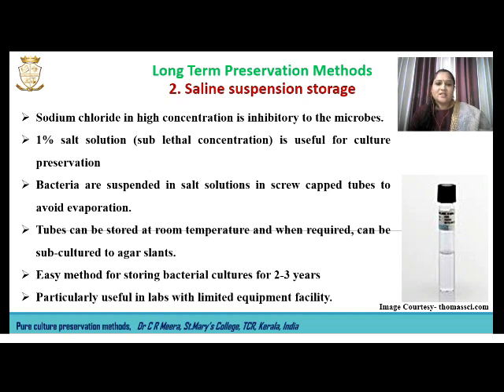Here, the bacteria is suspended in the salt solution and we have to make use of screw-capped tubes in order to avoid evaporation. Then these tubes are kept at room temperature and we can subculture onto the suitable media as and when required. This is a very easy method for storing bacterial culture for 2 to 3 years. And this is very useful in the laboratories where limited equipment facility is available.